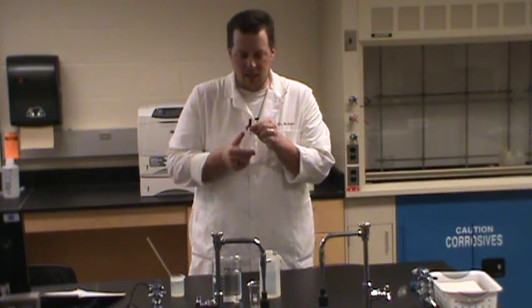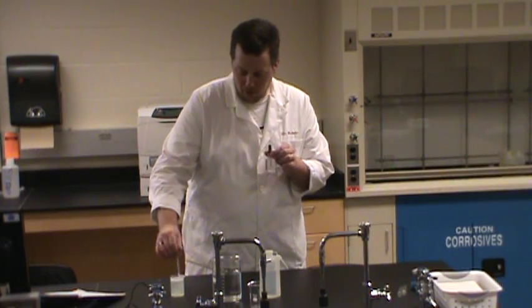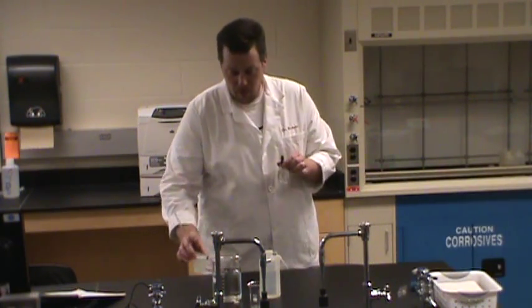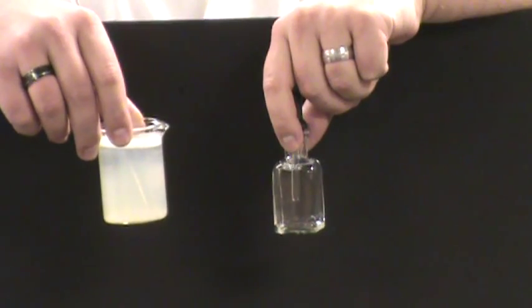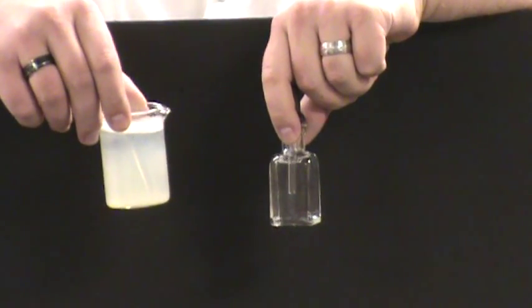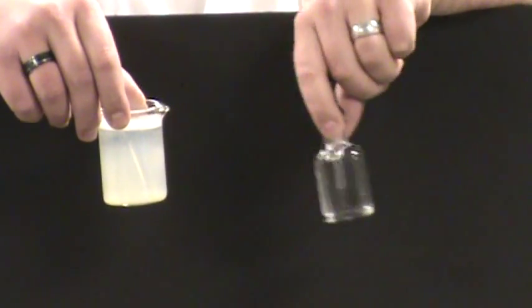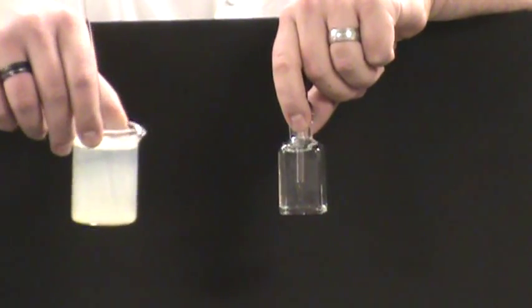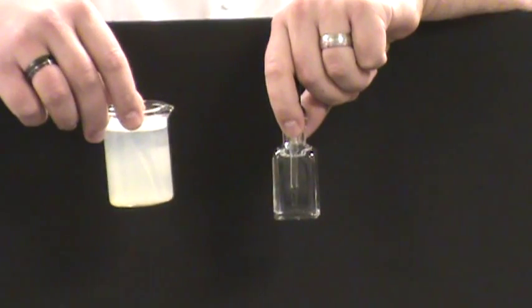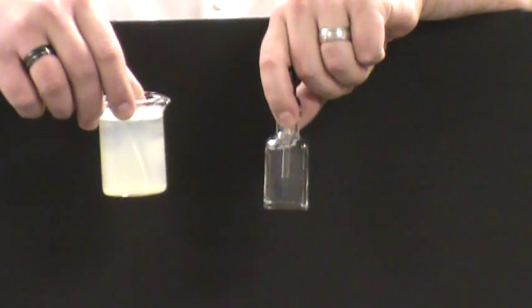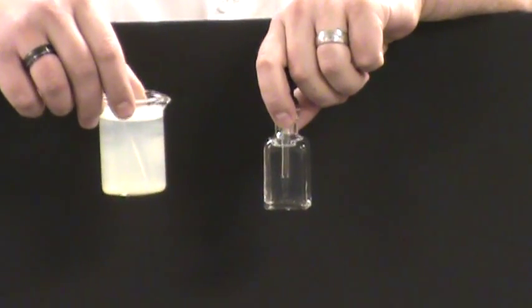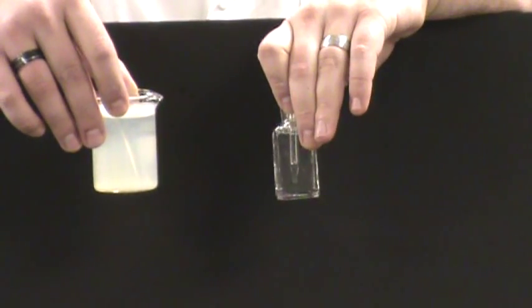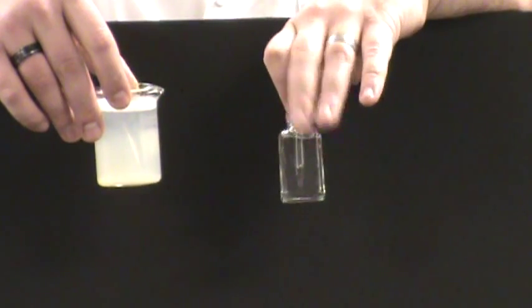Let's think about it in terms of some counterexamples. If you wanted to compare these two solutions, these two substances, how would you describe both of them? We've got one that looks like water because it is water, and we've got one that looks not like water. I would bet that a lot of you would call this one white. Then what do you call this one? If this is white, we need another term for this.